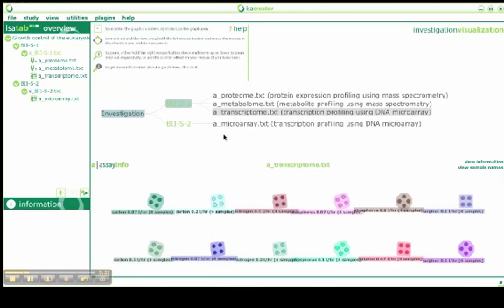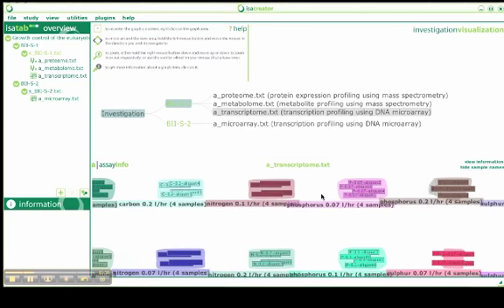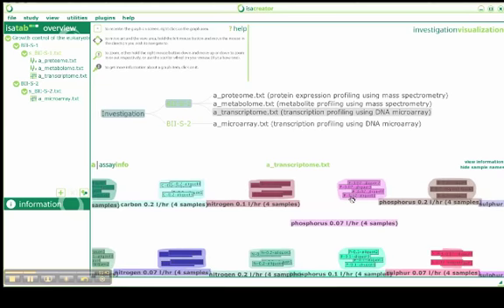We can toggle the display. Here we've got the information about the treatment, but we also can display the sample information in the dots, which makes the information a bit more crowded, but you can zoom in the tool and possibly have a bit more information about the samples. Currently we are working on developing this visualization component, and we will be posting hopefully new developments and new functionalities in the tool soon in 2012.